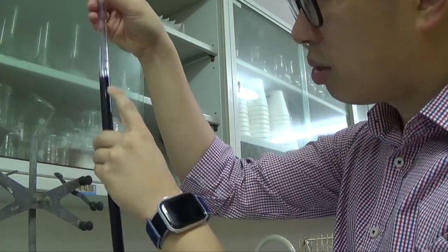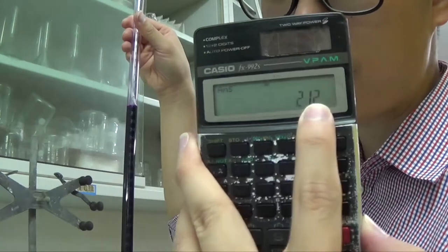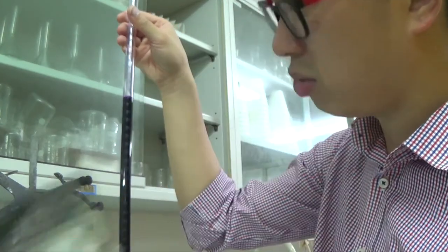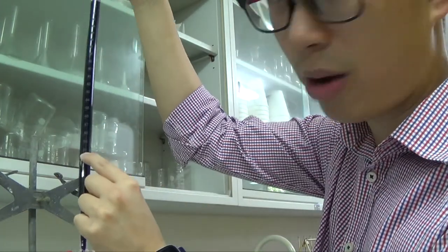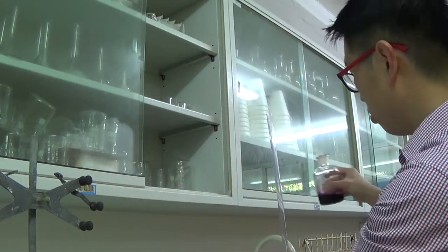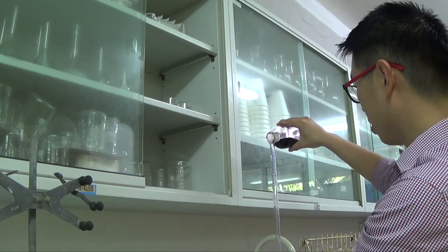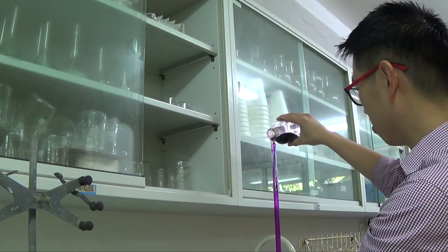So now this is around 30, and I know my end point is roughly my rough titre minus around 3 cm³, which just now was 21.2. 30 is not a good value to start because I might run out by the time I reach 50. So I want to fill this with KMnO4, and ideally you'll be using a funnel, but I think I'm experienced enough not to spill it. But if you are careless, then you can spill it, all right?